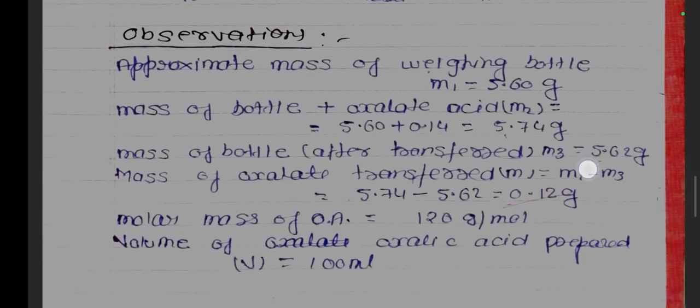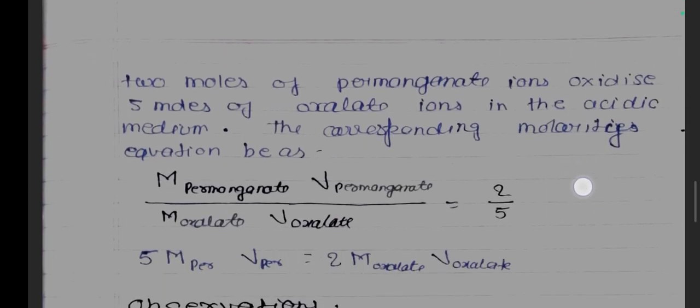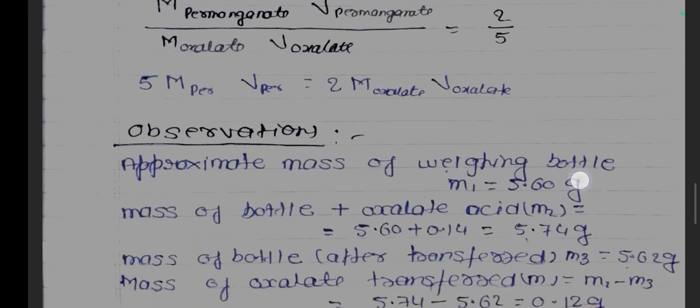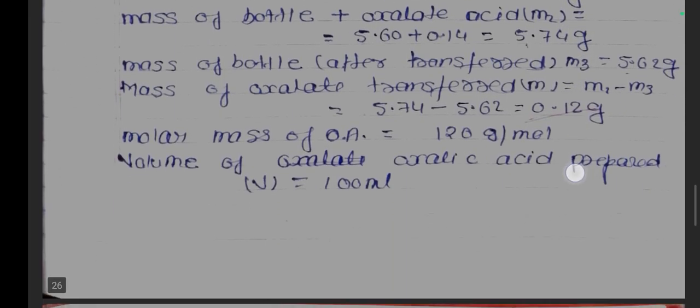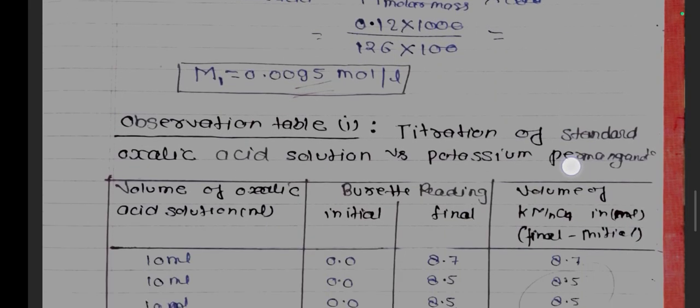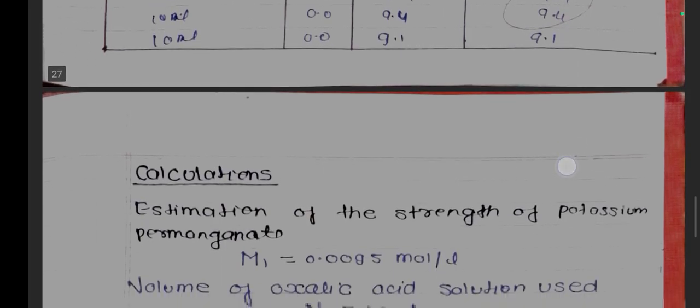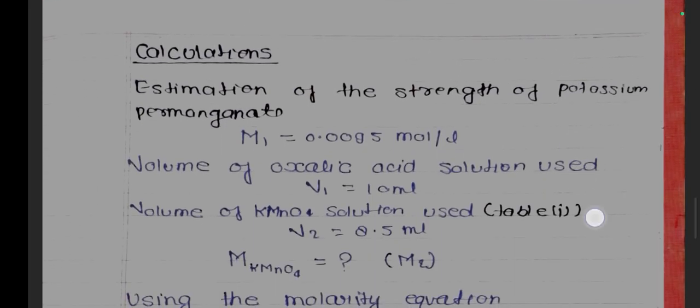Observation table. Calculations: estimate the strength of potassium permanganate.